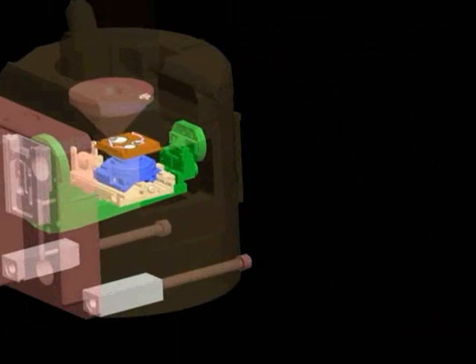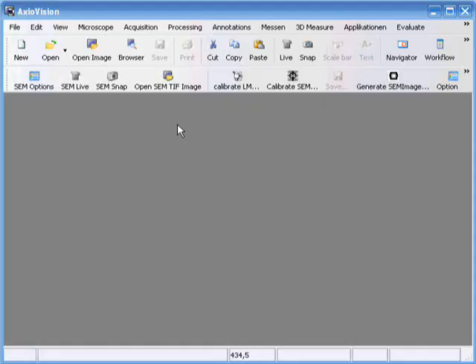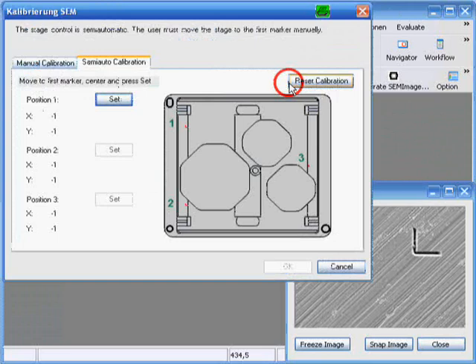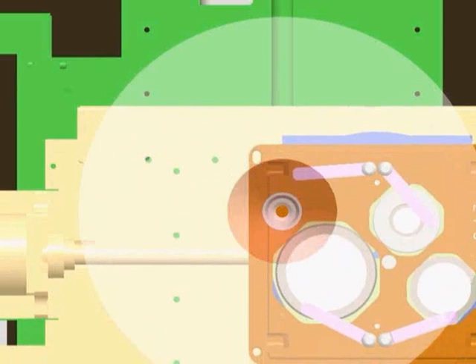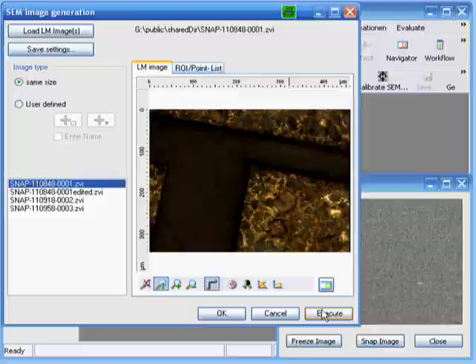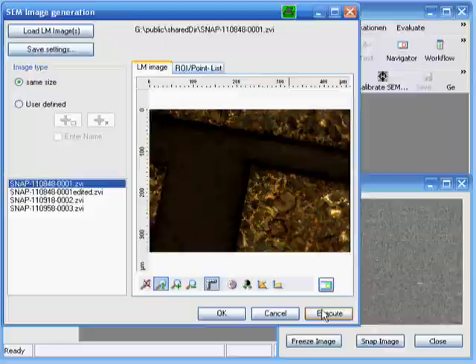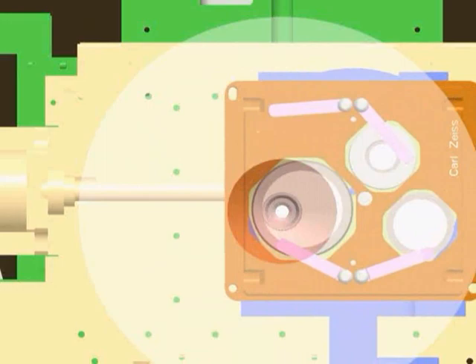This is followed by the same calibration procedure used for the light microscope. Shuttle and Find is based on the philosophy of maximum convenience and a consistent look and feel. The light microscope images are now loaded and previously stored regions of interest are relocated. Their size automatically defines the magnification of the electron microscope.